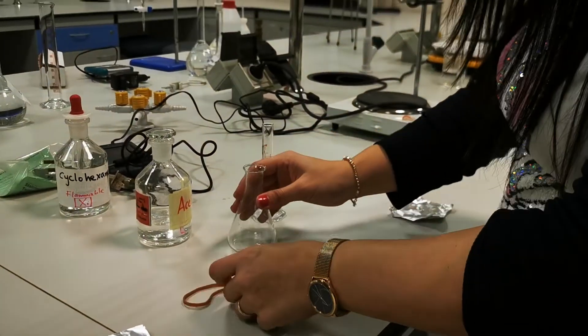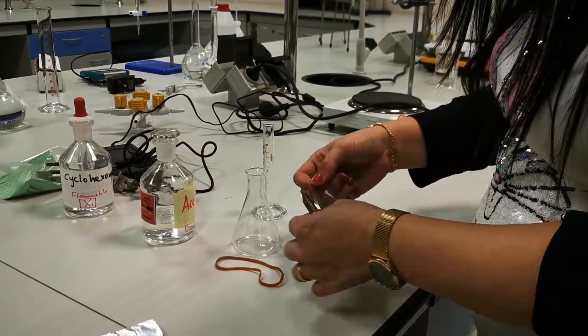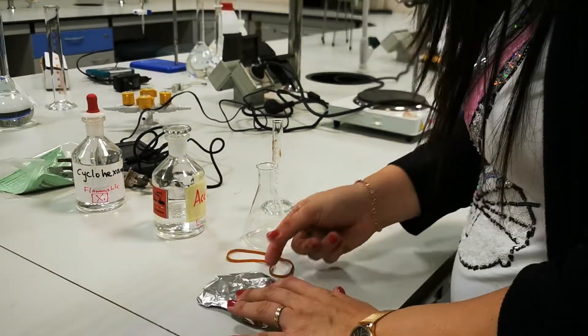Okay, so this is the Erlenmeyer flask, the rubber band, and the aluminum foil that we already measured the mass.